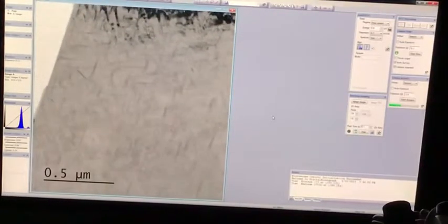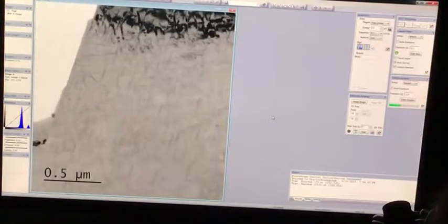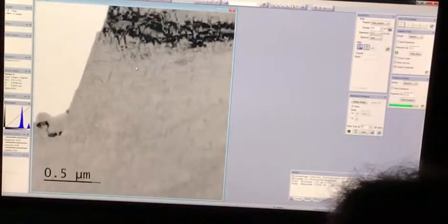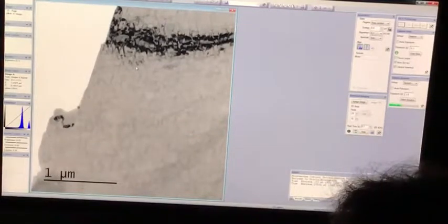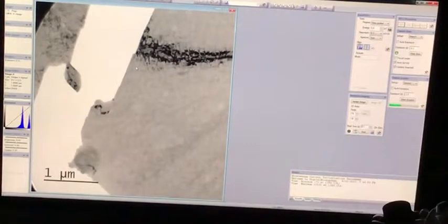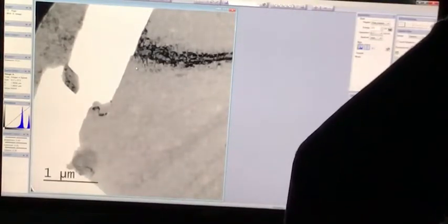Let's see if I can zoom out a little bit without hurting the detector. I'll just put the cursor over it. 6,000 counts, not too bad. I think we can keep going. Okay, that's okay. You can see the edge of the objective aperture right there in that corner. So I'm going to align things carefully. Good. There we go. That got it.